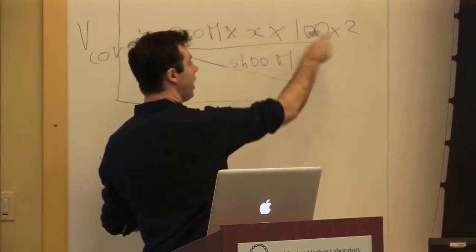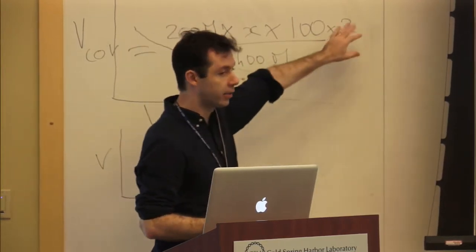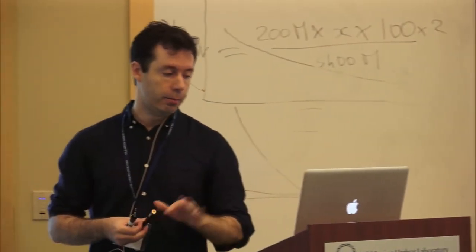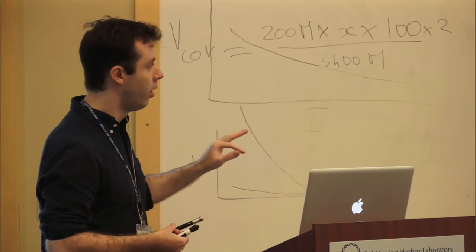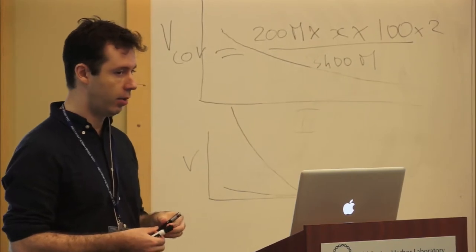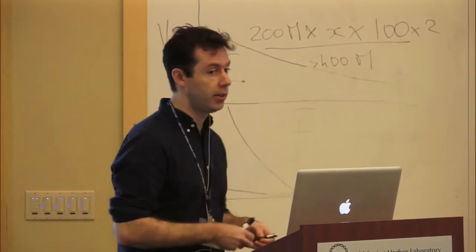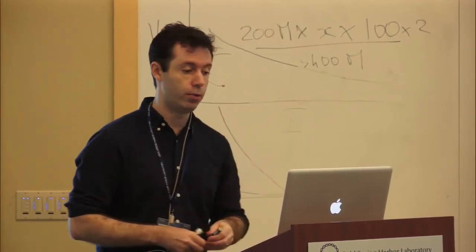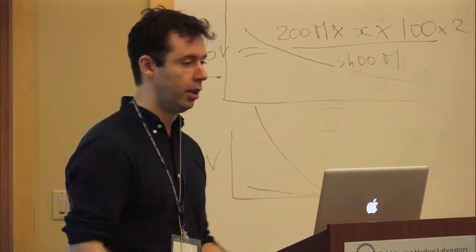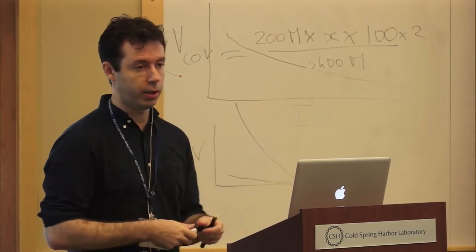Out of all of these reads here, not all of them are going to map to the genome. So you do need to have a factor that takes into account this incomplete mappability. Typically, if you sequence a human genome, you get about a 90-95% read mapping rate. But you have other issues, and one of them is the clonality issue that we discussed. When you do genome sequencing, reads that map to the same location in the same orientation, you have to collapse them into one, and therefore you can't use them to get the coverage.